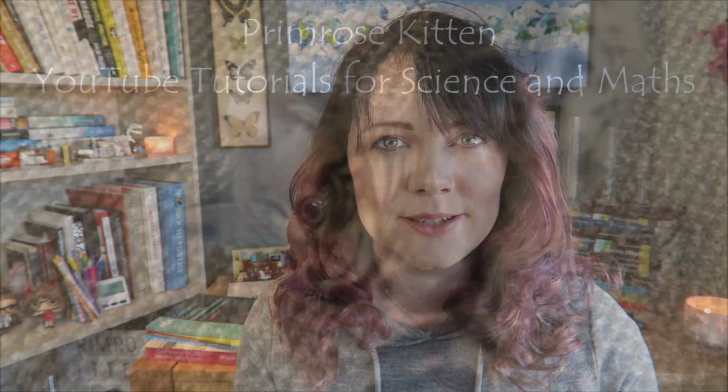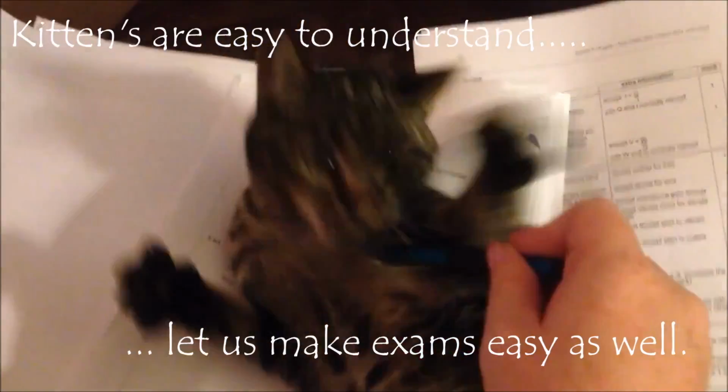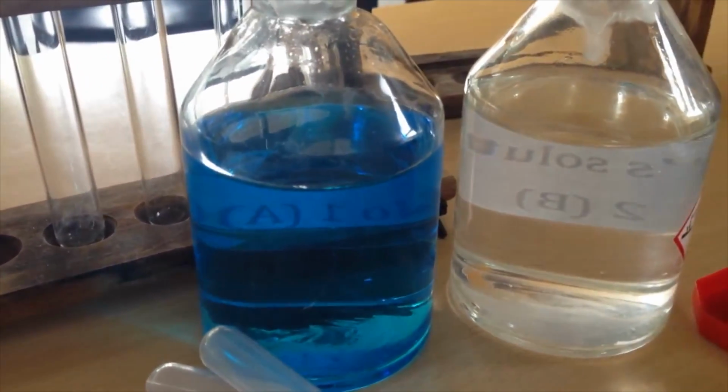Hey guys, in this video we're going to be looking at the Fehlings test for an aldehyde. So this is going to be a test for an aldehyde.